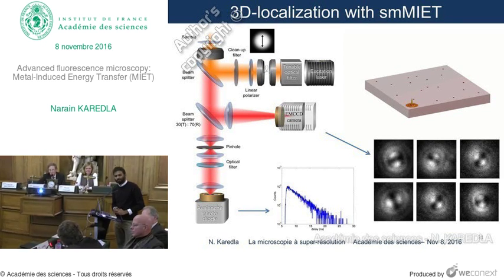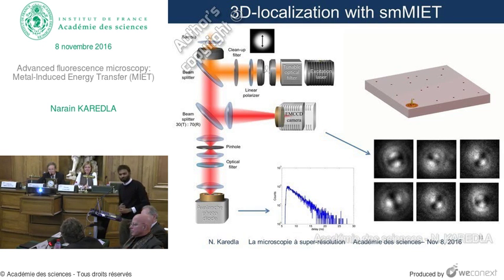So first, you have to scan, if I understand. So there's some sort of temporal dynamics: if you want to look, for example, at cells that are moving, it is necessarily a bit limited by the sequential acquisition that you have to do. So I don't know if there is any kind of solution for that. For the cell measurements, for example.